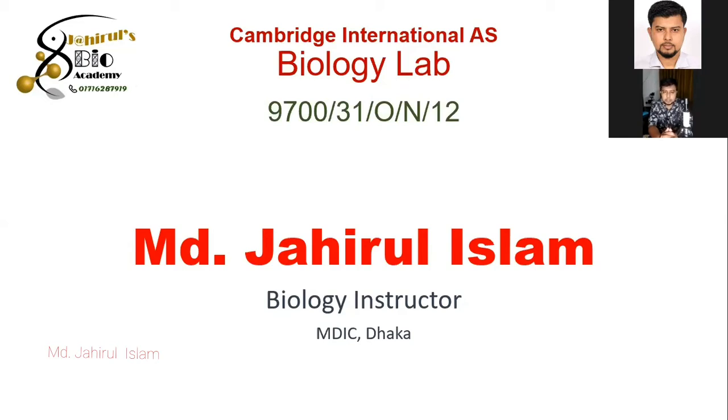You know that there will be two questions in the Cambridge AS level exam practical paper. The first one will be biochemical and the second one will be microscopic. So for the microscopic question, we are doing today October November 2012, variant 3, question 1. I'll select the slide and set it in the microscope, and then I'll take the picture and then I'll solve it in the classroom.